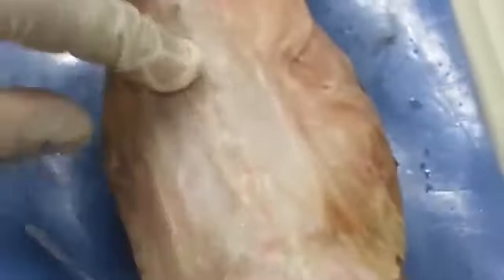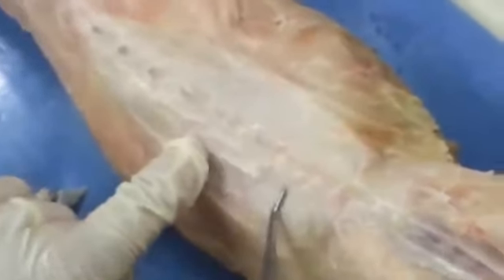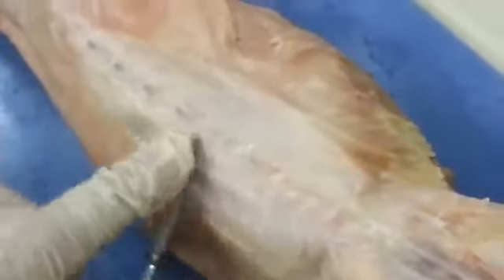Making our way cranially, we didn't dissect it here, but on that cat, we could see it, was the erector spinae groups, deep to this aponeurosis here. So if you see anything pinned in this region, that's what it would be, right? The erector spinae group. And the erector spinae then would be the antagonist to the rectus abdominis, where these guys would extend the spine.